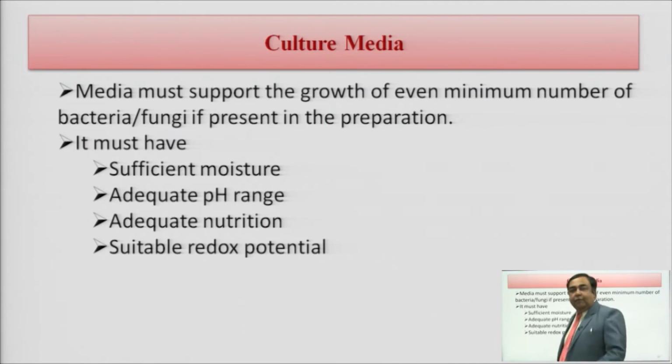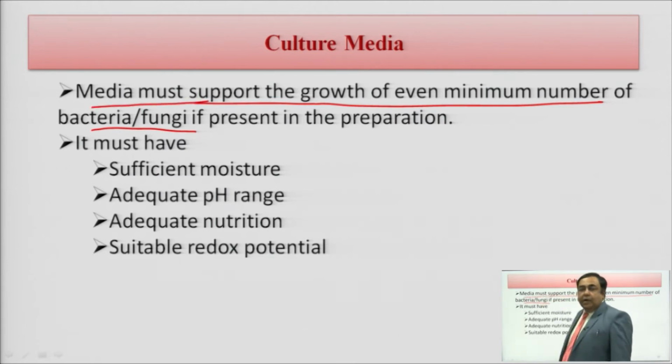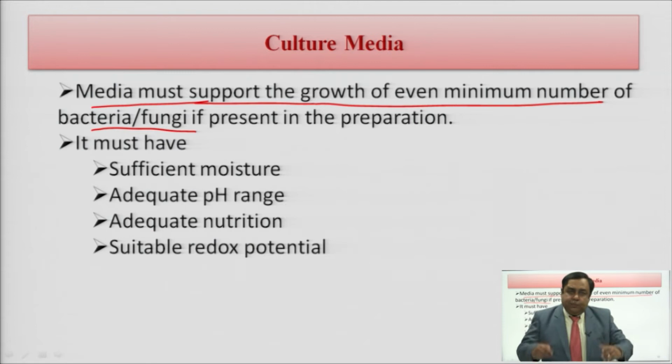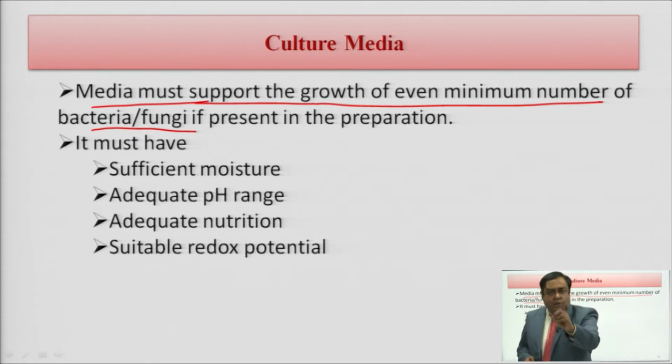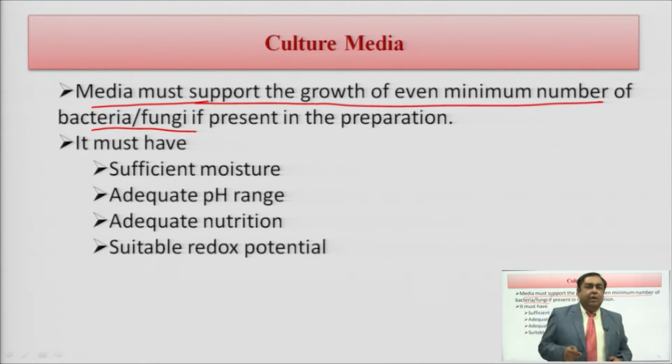Now, the culture media, I have told you, one is aerobic media, anaerobic and fungi. Therefore, the media must support the growth even if the minimum number of microorganisms, either bacteria or fungi, is present. The media should be nutritionally enriched, so that even if one cell is there, it will try to multiply. So, media must support the growth of even a single bacteria if it is present. Therefore, it must have sufficient moisture, adequate pH, adequate nutrition and suitable redox potential.